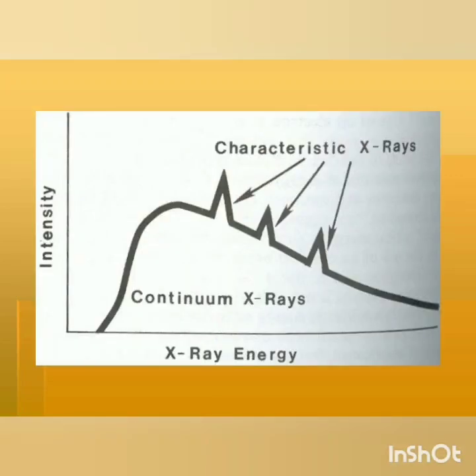The characteristic X-rays appear first as continuous X-ray, and with the help of an instrument called energy dispersive X-ray spectroscopy, the spectrum is resolved into different peaks, and these peaks can be identified into different elements by using the periodic table mode of the spectroscope.